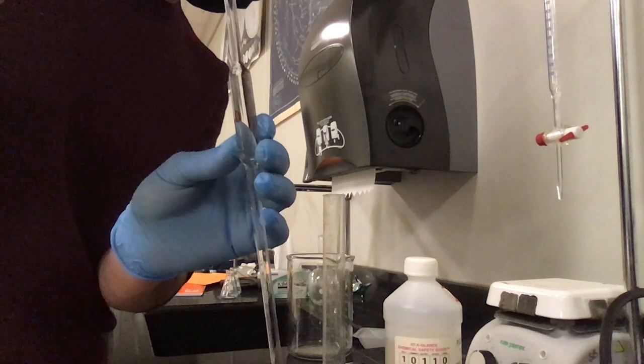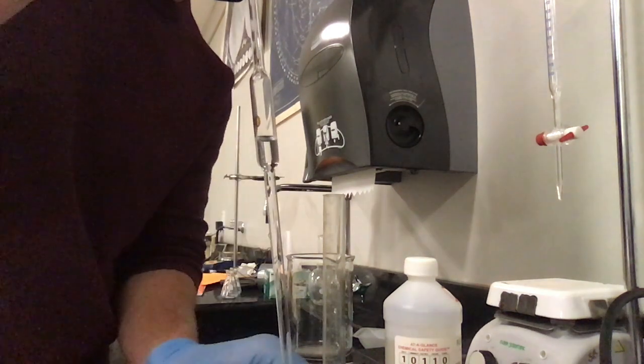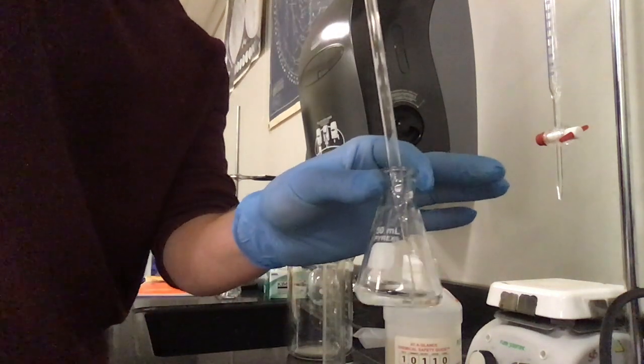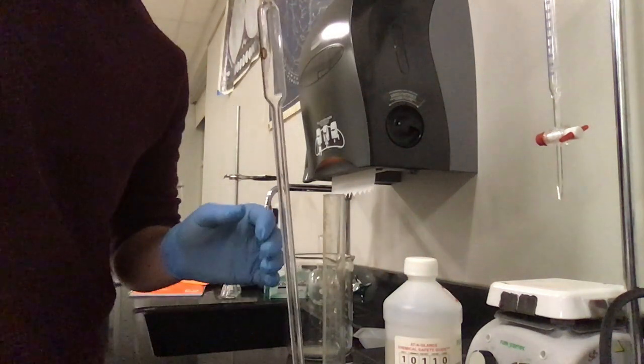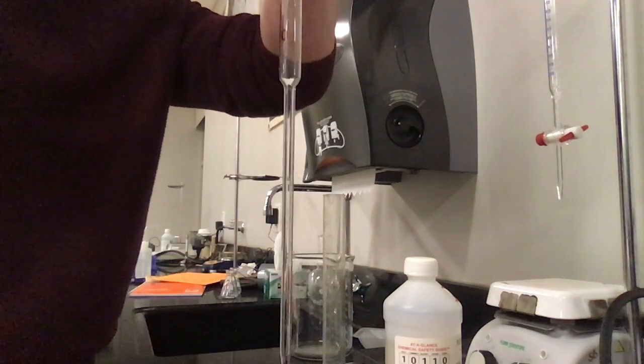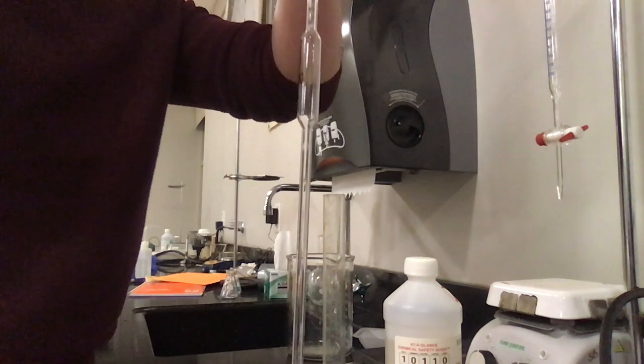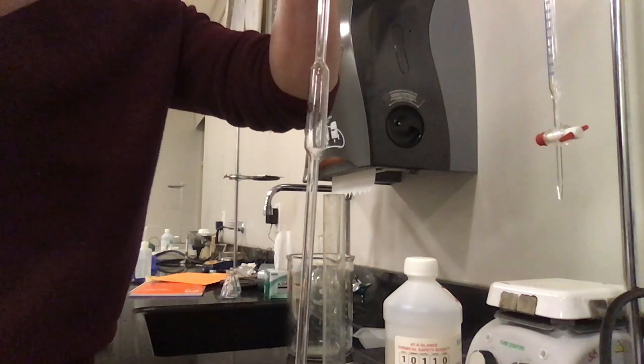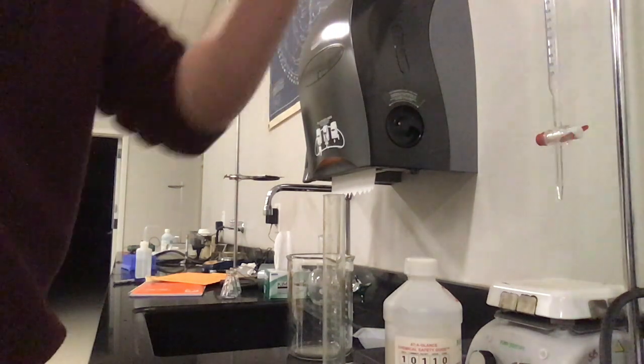I'm going to empty this into my Erlenmeyer flask. There, it's being emptied into my Erlenmeyer flask. Now I have that little bit of acid at the end. I'm going to inflate my bulb. I'm going to press the S button for sucker while putting positive pressure on that bulb. I'm just going to spit all that acid down into that Erlenmeyer flask.